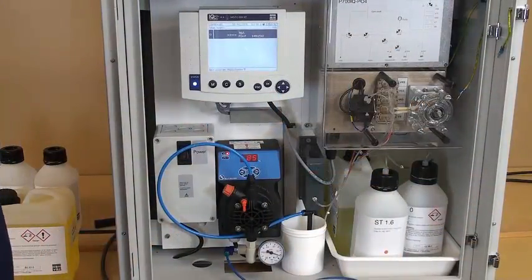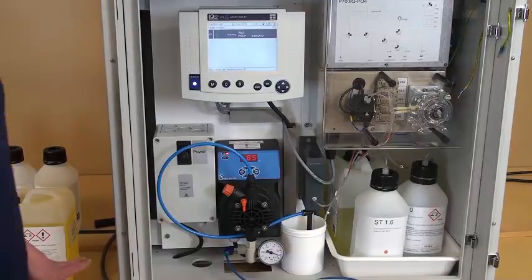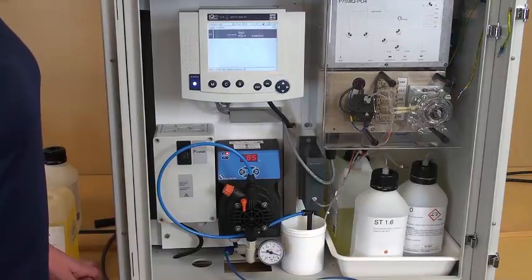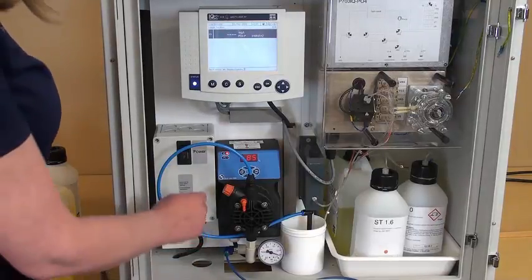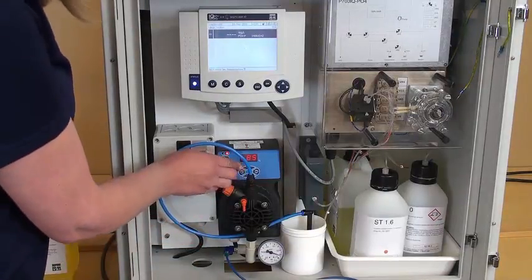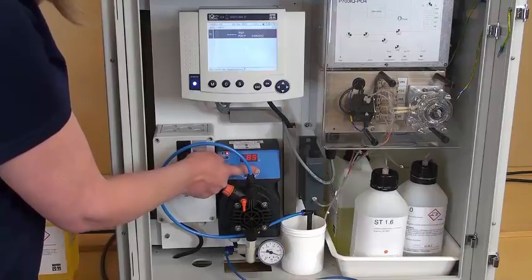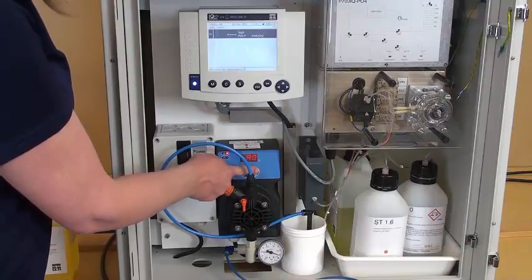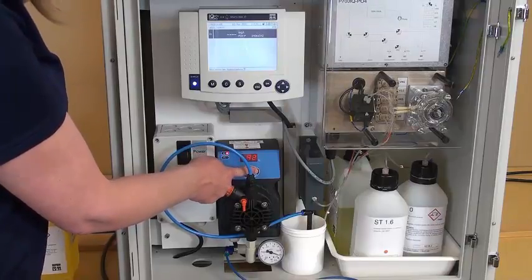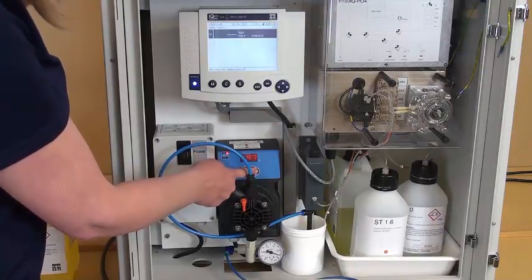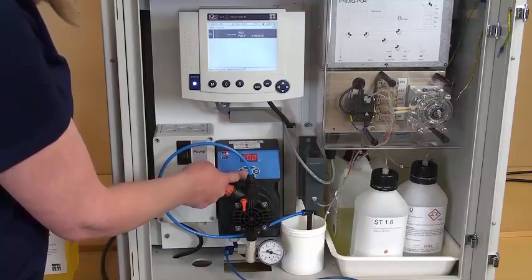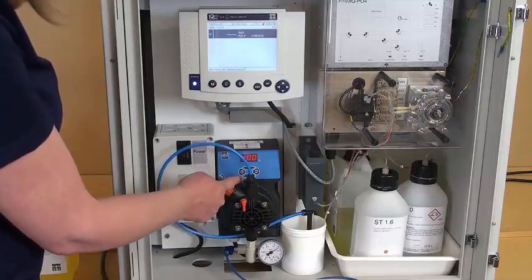After powering the unit and connecting your reagents and solutions, we're going to prime the pump by increasing the percent to 100 and then starting the pump.